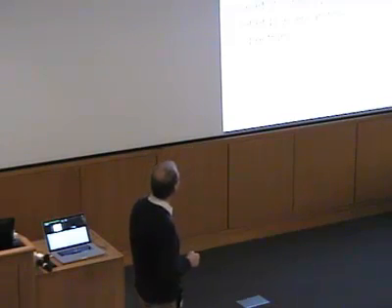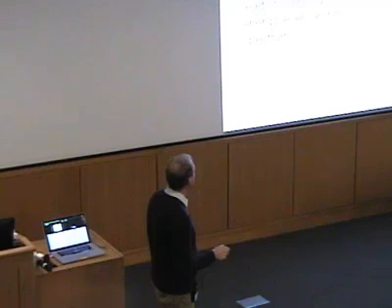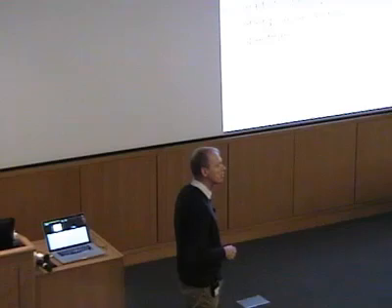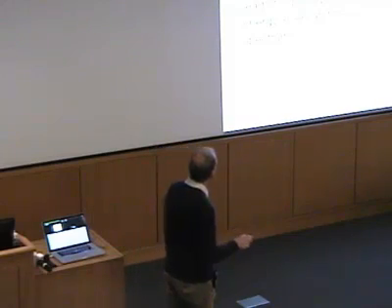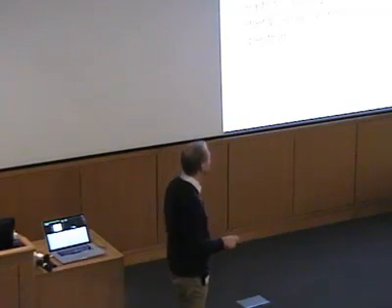And so what happens to our energy level diagram now is that up here I would have one of the two spin states, so S equals plus 1/2, and down here S equals minus 1/2, so the two possible orientations of the electron spin. But each of those levels now gets split into 2I plus 1 levels. So if I is 1 here, then I have 3 levels with m sub I, the quantum number, being minus 1, 0, or plus 1. And the same thing down here.